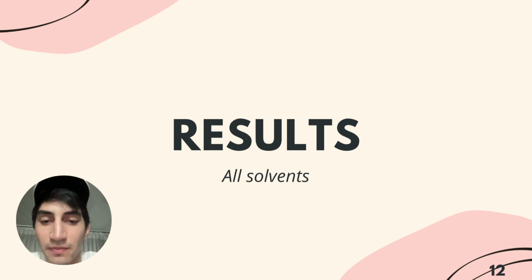Now we will compare the results obtained from crude oil without solvent and the crude oil mixed with different solvents, which are the acetone and the toluene. Both of them are at different concentrations, which are 5, 10, and 15%.